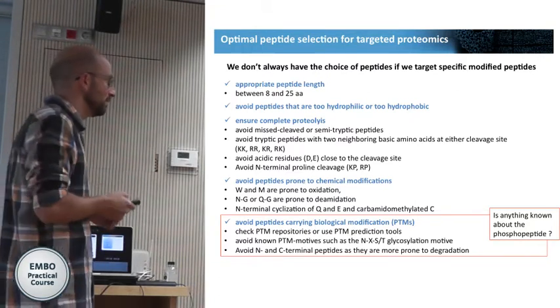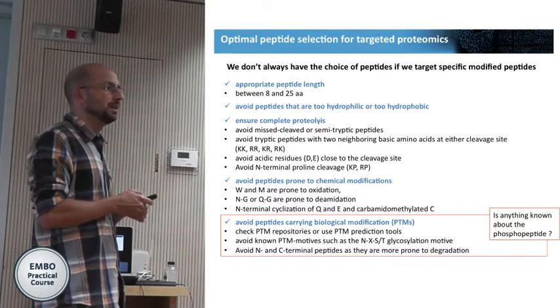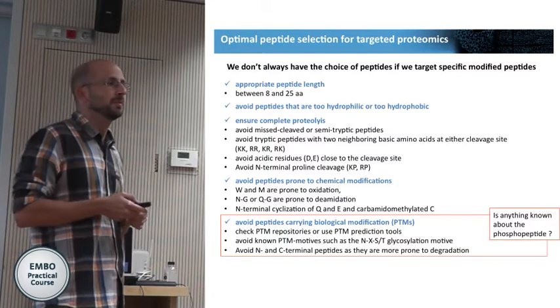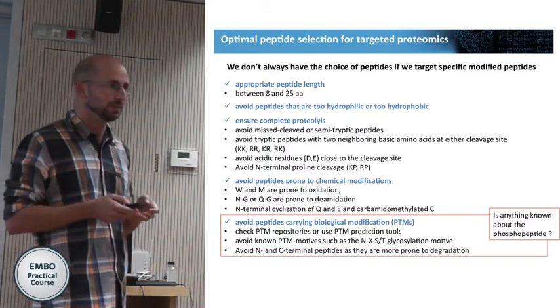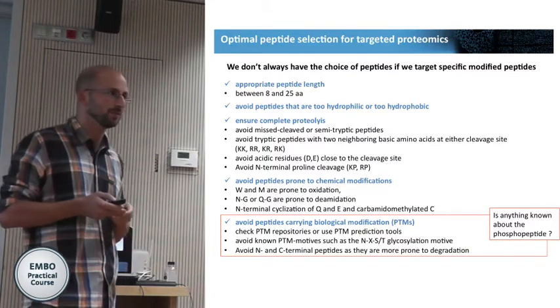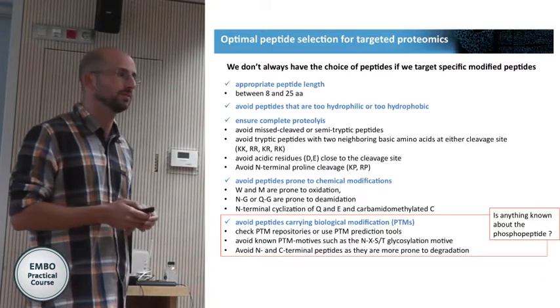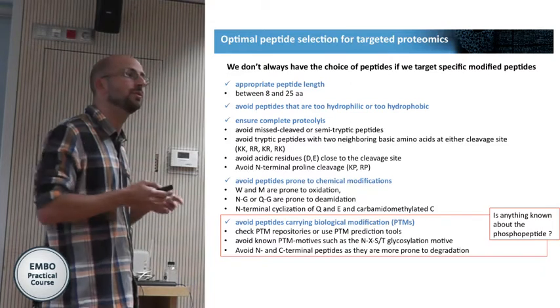What is very important to remember, and I will keep coming back to this point, is that when we're trying to detect a phosphopeptide of interest, it's very sample dependent. So just like a protein, also with a phosphopeptide, if you're not working within the right conditions, you might not see this phosphorylation because you just didn't enrich it or whatever.